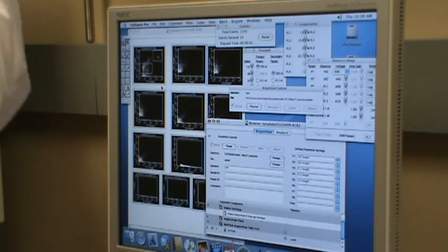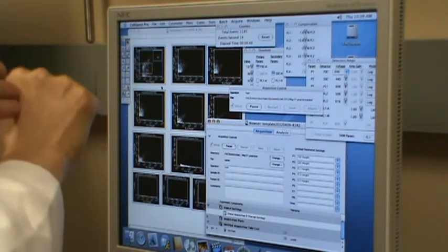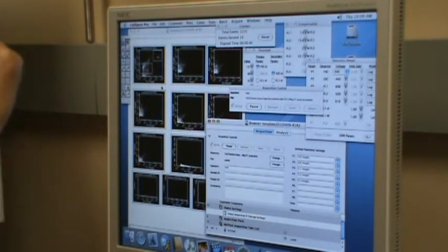The side scattering is the light that goes in this direction and you detect at this angle. That's the side scattering signal. If you think about why some aircraft cannot be detected by radar, that's the same principle. It depends on the granularity, the roughness of the surface. So the rougher the object is, the more it will reflect light, like in this case, laser.